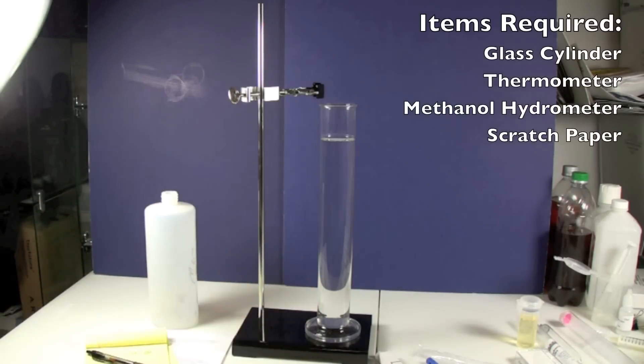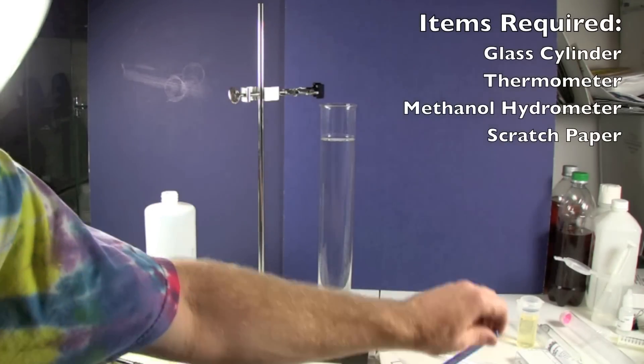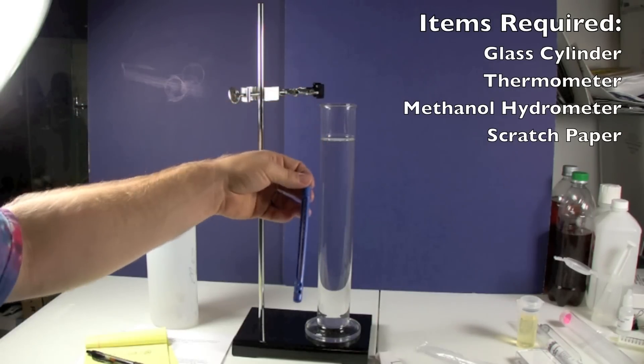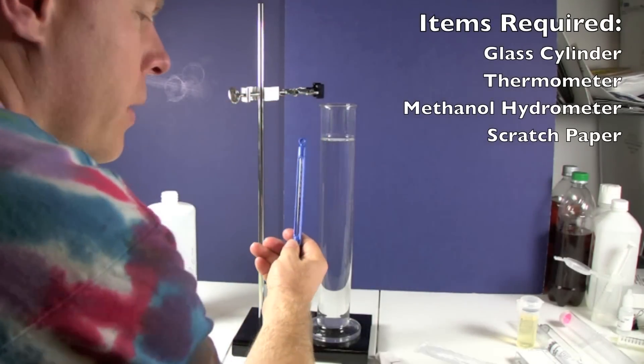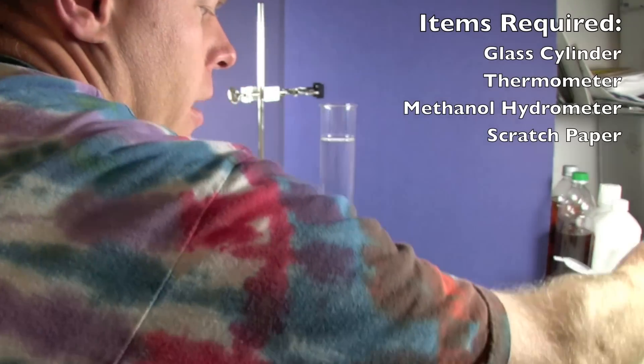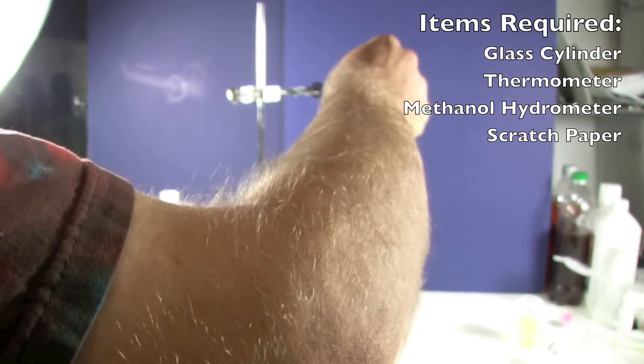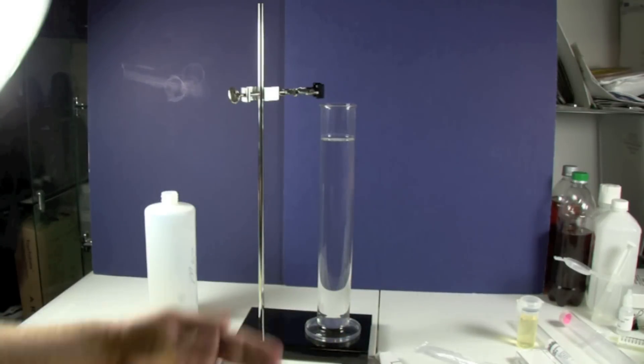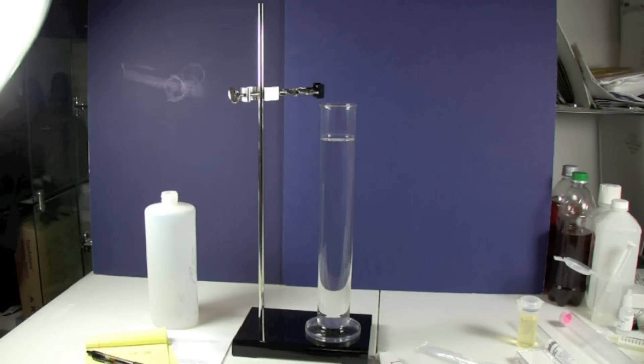To do this, you'll need a cylinder to put some methanol in, a thermometer that's accurate down to one degree. You'll need a hydrometer specifically for measuring methanol, which this one is. And then we've got this handy stand that allows us to put a thermometer in here and measure this.